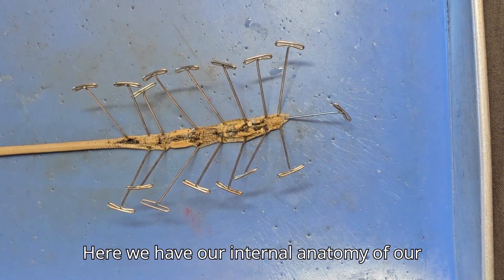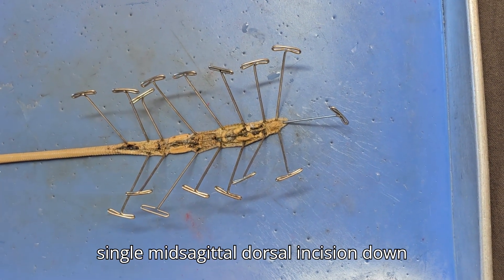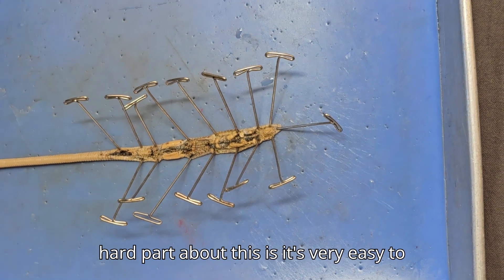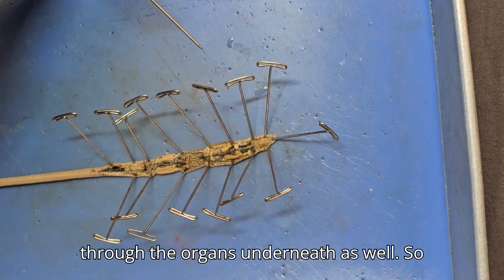Here we have our internal anatomy of our earthworm. What I've done here is a single mid-sagittal dorsal incision down maybe half the length of the worm. The hard part about this is it's very easy to cut through not just the skin but through the organs underneath as well.